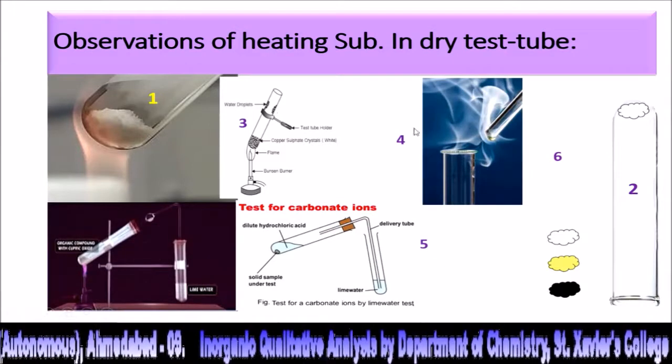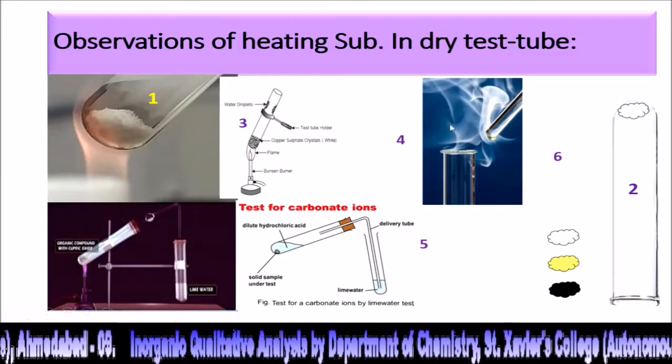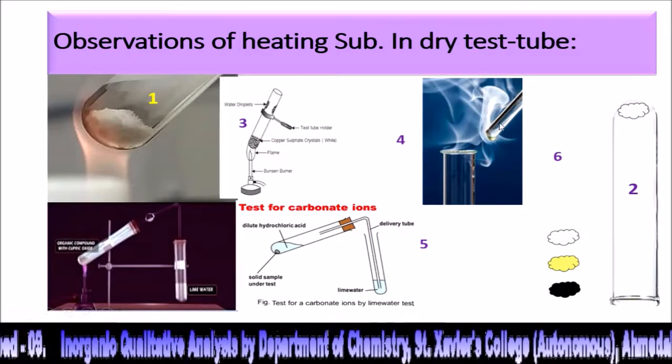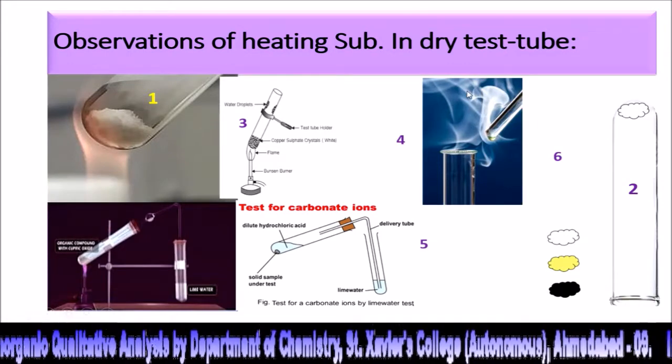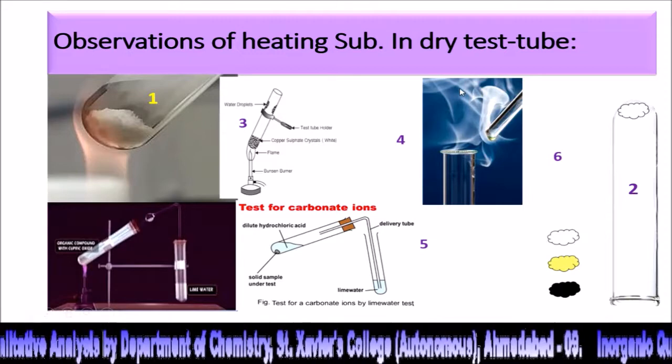Third, sublimation takes place if ammonia gas comes out, and if you put a stirrer dipped into HCl, and you notice this kind of white fumes coming out of the stirrer itself, then you can say that the coming gas is ammonia.